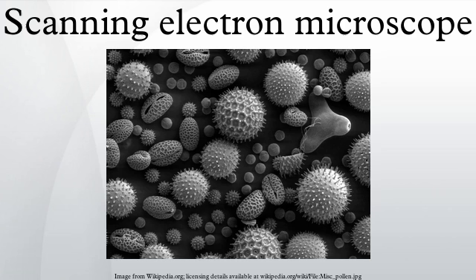The electron beam, which typically has an energy ranging from 0.2 keV to 40 keV, is focused by one or two condenser lenses to a spot about 0.4 nm to 5 nm in diameter. The beam passes through pairs of scanning coils or pairs of deflector plates in the electron column, typically in the final lens, which deflect the beam in the X and Y axes so that it scans in a raster fashion over a rectangular area of the sample surface.